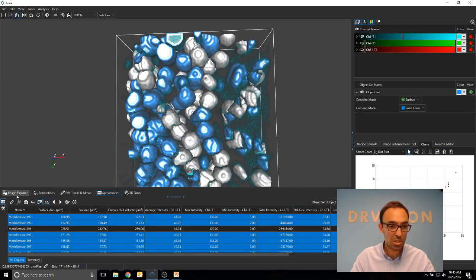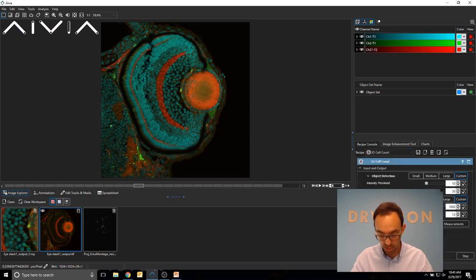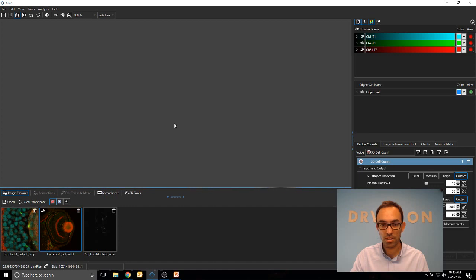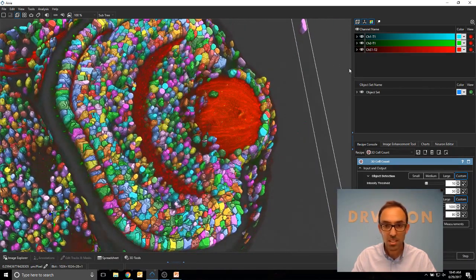All right, so I'll load the other bigger data set so you get a sense of how long it takes to apply. Primarily, that's the reason. And so that's rendering. Okay, so that's what it looks like when it's complete.